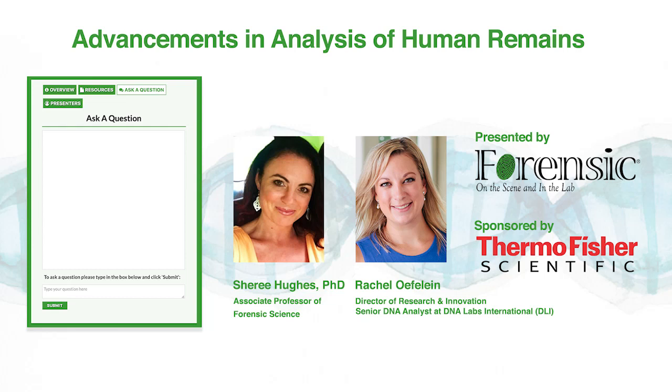Okay. And now, have you worked with and evaluated samples exposed to extreme conditions such as disaster victims or those recovered from seawater, like you mentioned? Yes, I'd say a big portion of the types of remain identifications we do are from fragmented remains from, say, a plane crash or something like that. So this would be a great option for processing those.